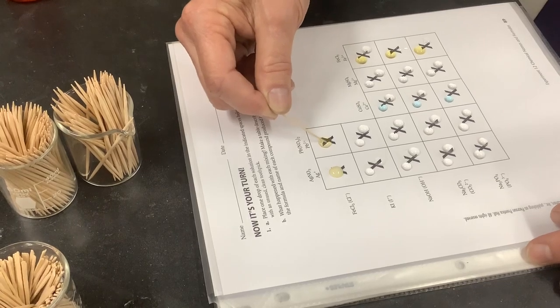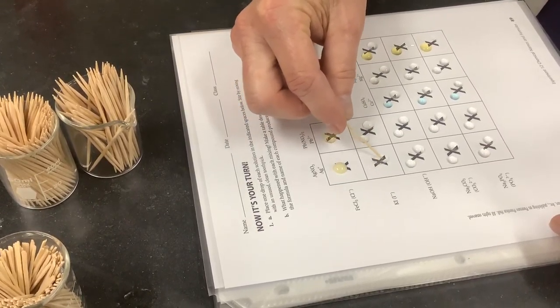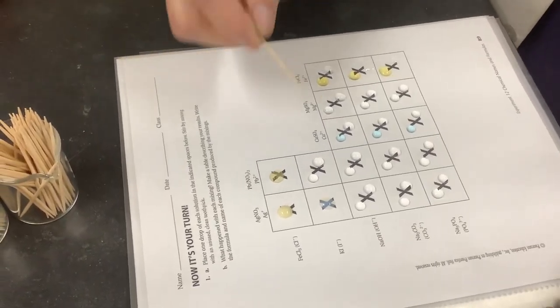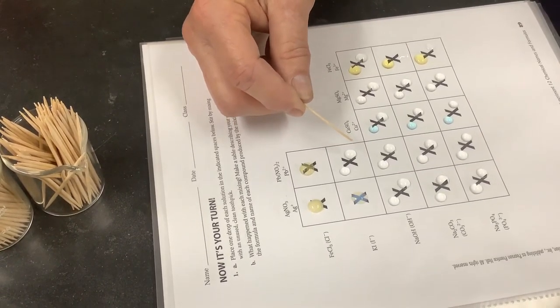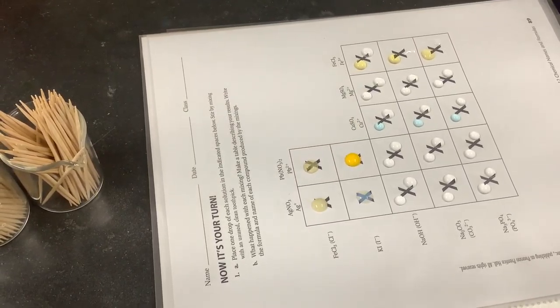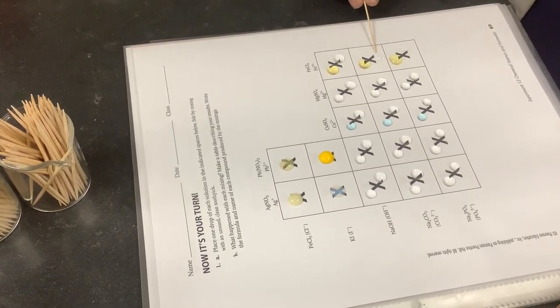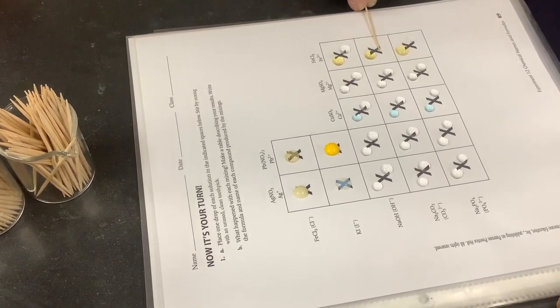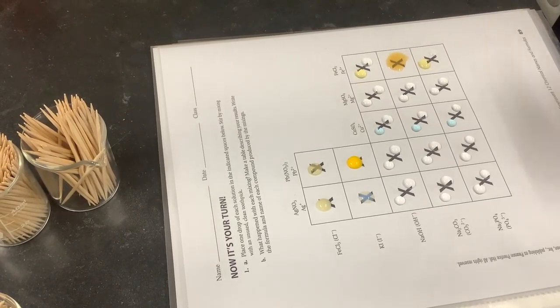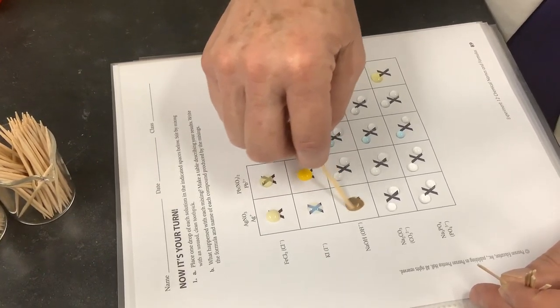Now I move my drops together and mix them with my toothpick. That's silver nitrate and iron(III) chloride. This is lead nitrate and iron(III) chloride. Here's silver nitrate and potassium iodide together, forming a precipitate and a color change.